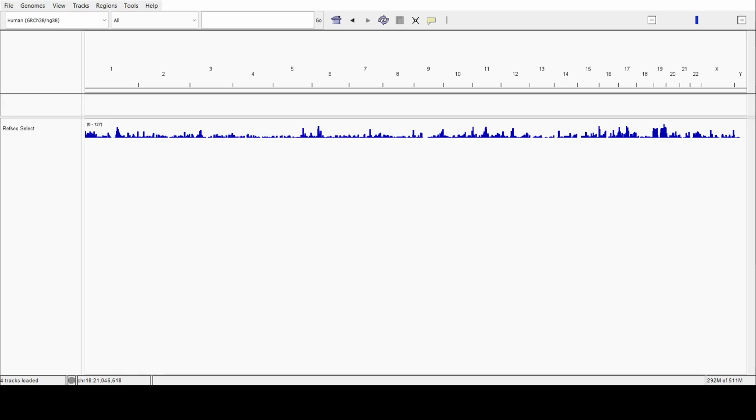Hey everyone, welcome back. In our last video, we used SAMtools to compress our alignment data into a sorted and indexed BAM file. We did a lot of heavy lifting in the terminal, but staring at text files is not how we actually find biological answers.